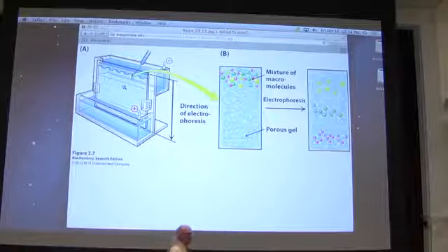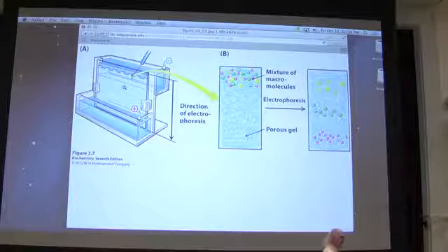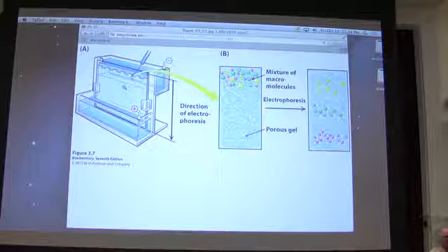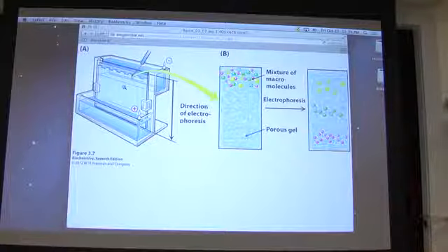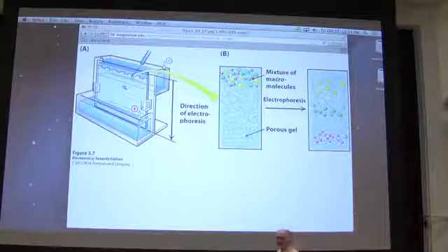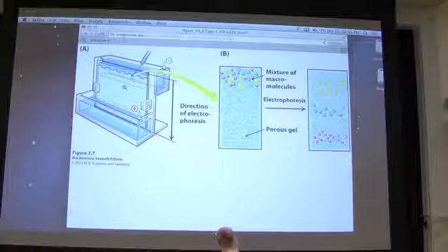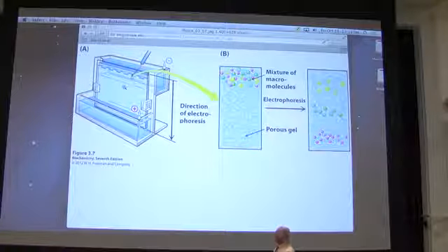Big stuff. Now, typically, we're not separating things that are quite that large. We're separating DNA fragments that are smaller than that. But nonetheless, DNA fragments are pretty large. So we have to have holes that they can pass through. If we block them from passing through, then we're not going to ever get them off of the gel that we're running. All right, so I make my gel. And we call this material a gel because it's kind of like Jell-O. It has a sort of liquidy consistency. We set it up so that we have buffer and we have buffer. And we put our DNA molecules that we want to separate right there in what's called a well.